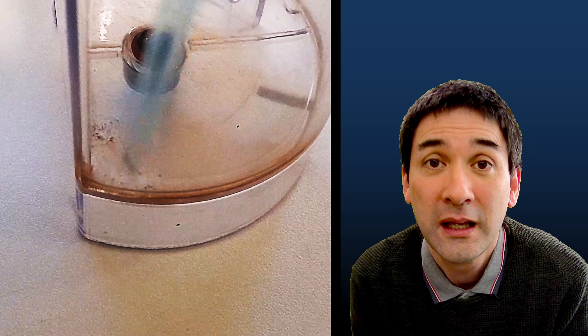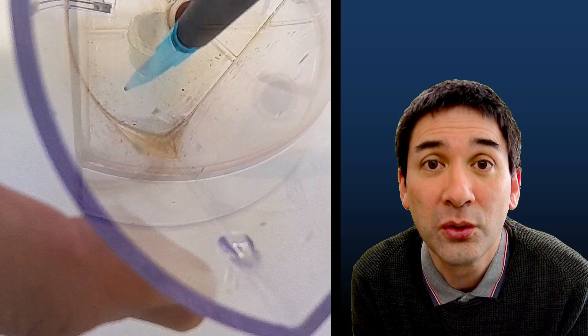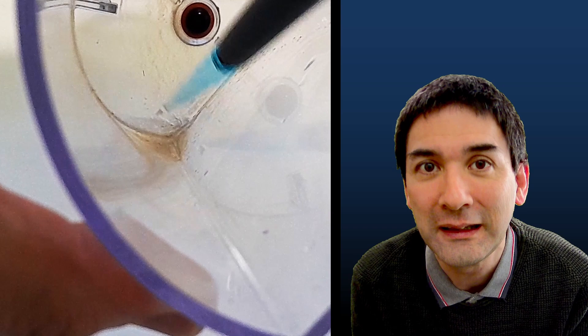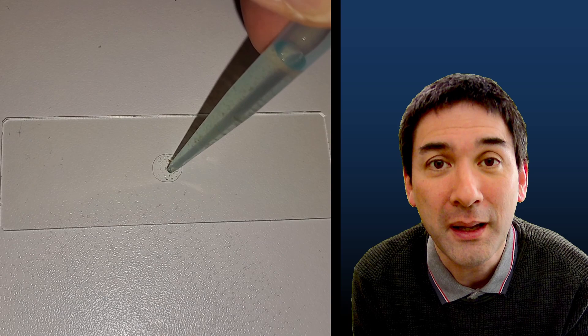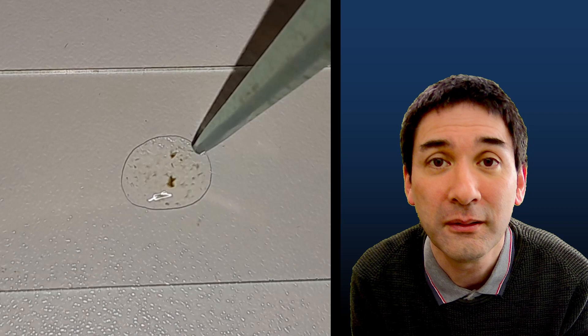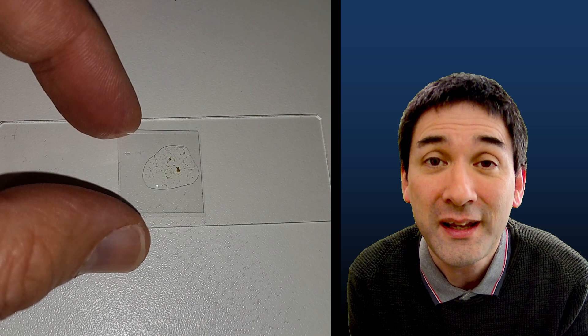And essentially, sometimes those biofilms can be quite complex and quite interesting to look at. Well, I think I have not cleaned this container for quite a long time. And when I put it under the microscope, or at least on the microscope slide, I could already see that there were tiny little flakes of the biofilm visible. So I was already very motivated and very positive that I'm going to find something interesting. And sure enough, this is what I saw.